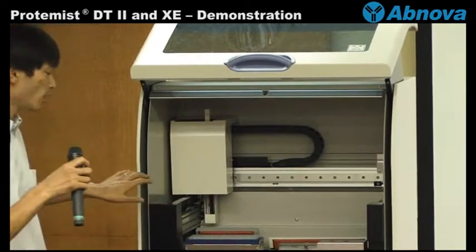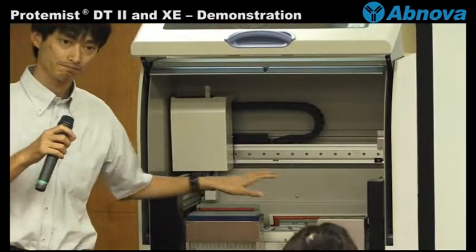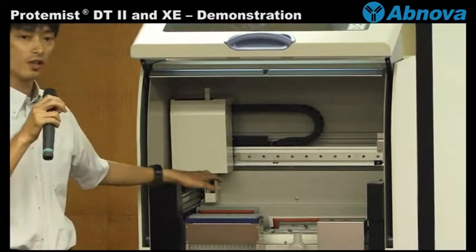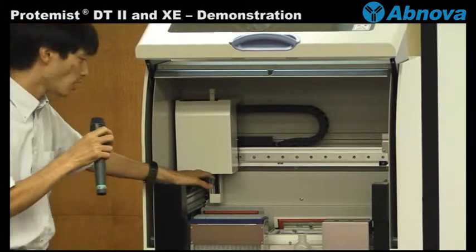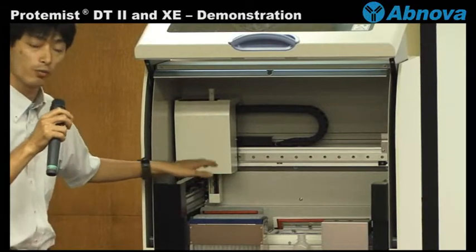This robot has two incubators. One is the reagent unit. The reagent unit is the storage for reagent. Temperature is controlled always at 4 degrees.